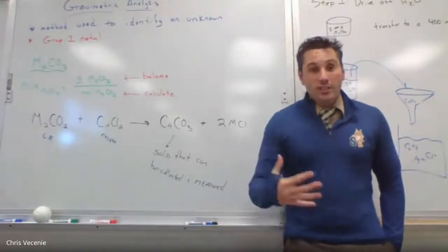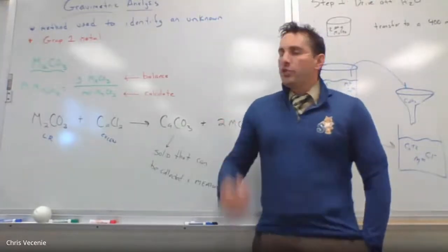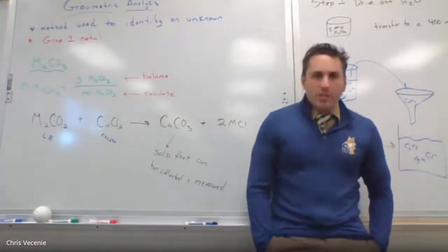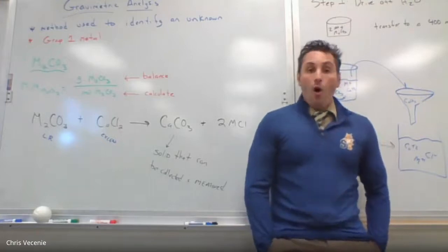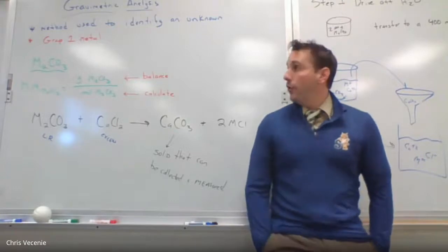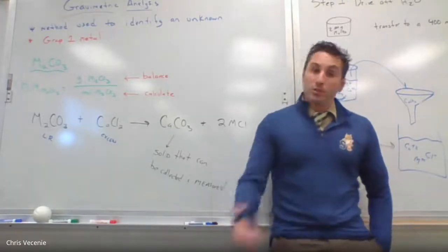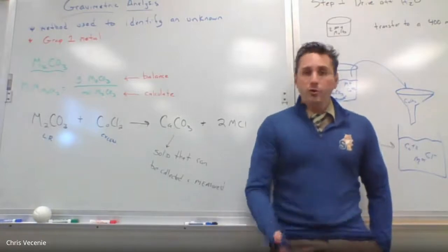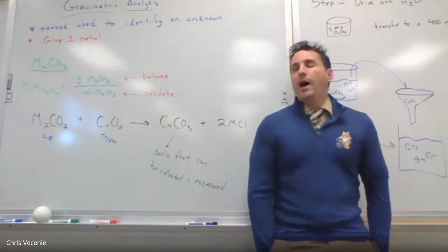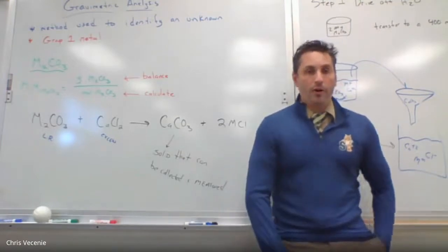Hey guys, so like I just said, I wanted to get you back into the lab. The chapter we're working on, with the notation and subatomic structure, is all good stuff, but it doesn't lend itself to a lot of experimentation. So the lab we're going to look at today links a little better to some stuff we already covered. The good news is it'll be mostly review. The bad news is that it's not directly related to what we're currently learning.